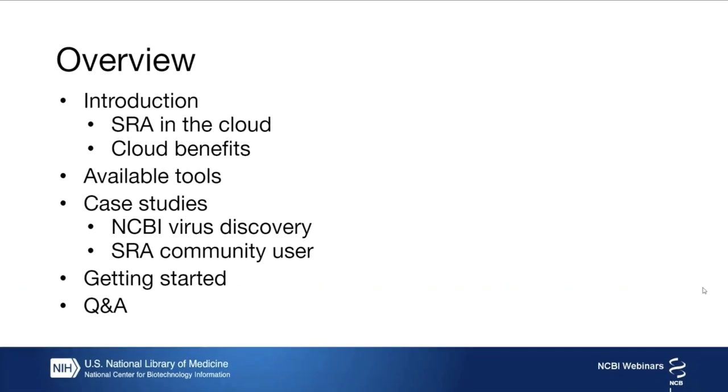So in this webinar, we'll cover some basics like introduction to SRA and why SRA was moved to the cloud, the benefits that you'll get from working in the cloud, and of course, the tools we've made available so far. I'll cover 2 case studies that highlight cloud usage and provide you some information and links of where you can go to get started with using cloud resources. And at the end, we'll hold the Q&A session.